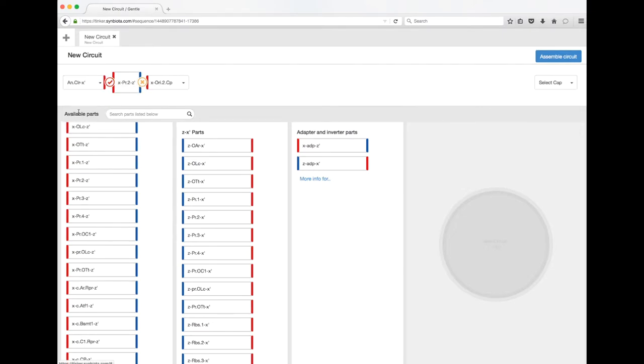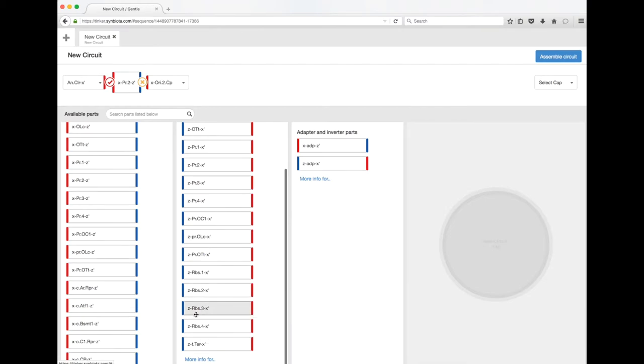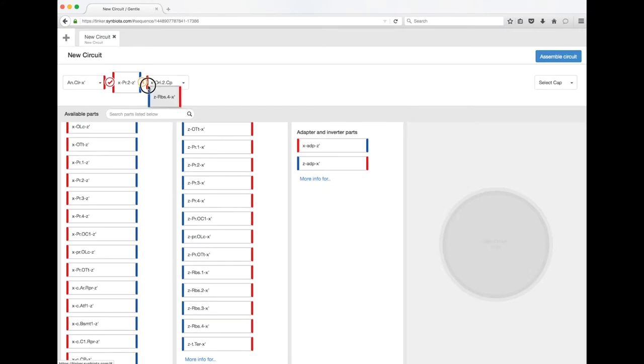I'm going to choose an anchor to match that. Remember, the promoter tells the cell to transcribe the DNA next to it into RNA. The next part that you need, which is really important, is a ribosomal binding site. This is a part that tells the cell to translate the RNA next to it into protein via the ribosome.